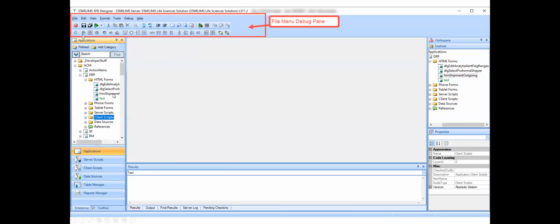And then when placing controls and objects on the forms, and we'll get to that soon, these are the alignment buttons that you can utilize for multi-selecting groups or multiple controls and make the form nice and neat and adjusted and regimented looking. And then you have standard arrangement positioning on the form where you've got multiple controls and you might want one to appear in front of the other in the hierarchy of the object selectability features. So this is move to front, move to back.